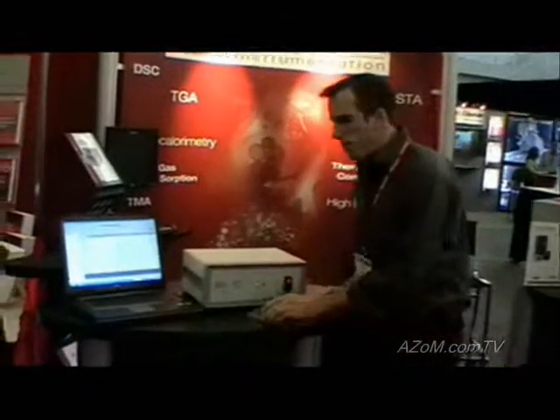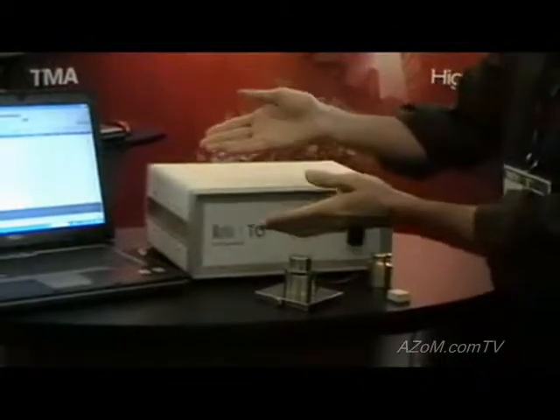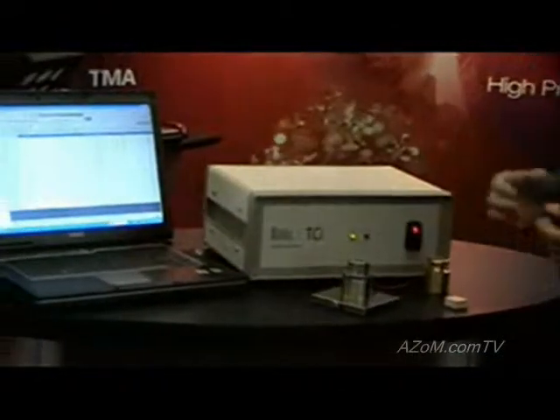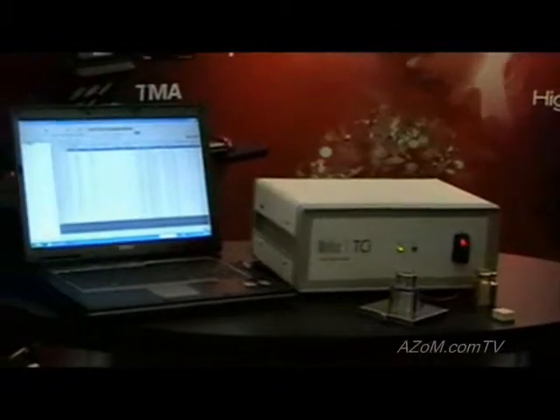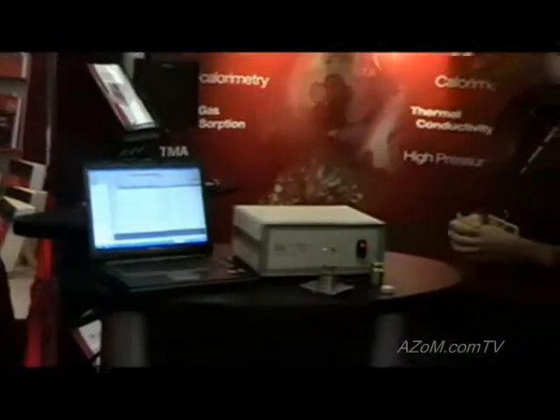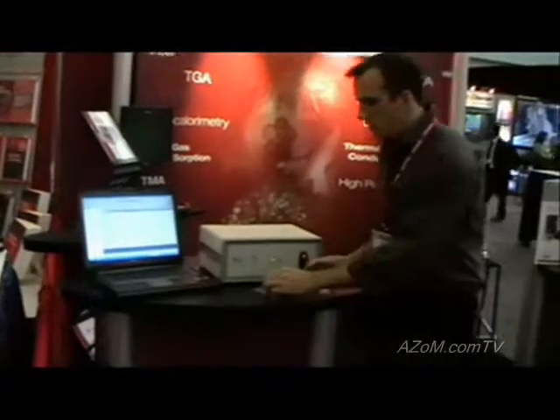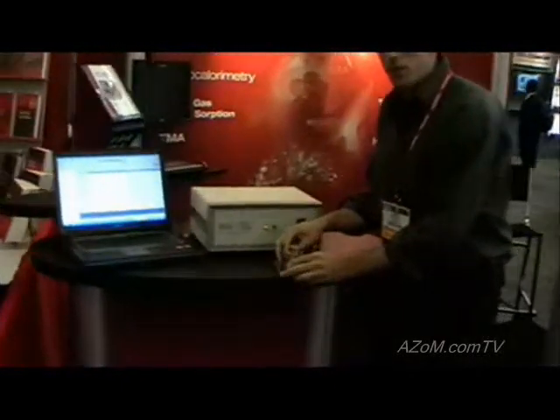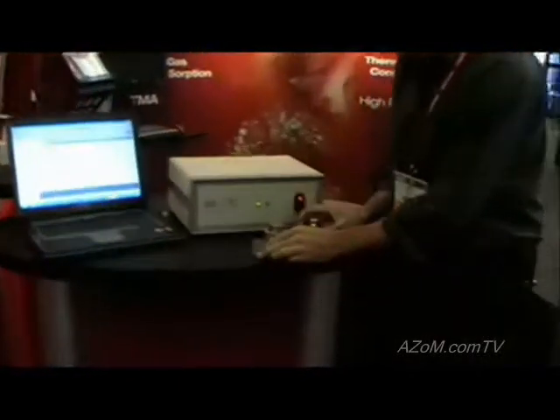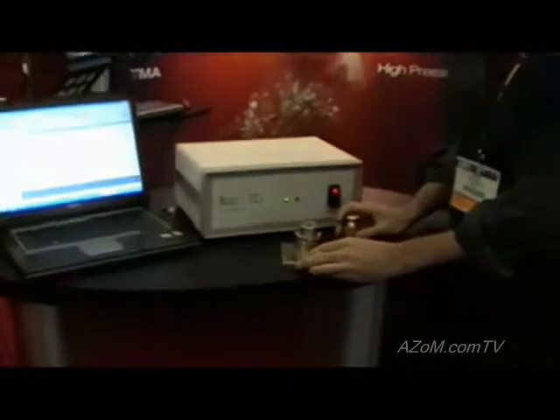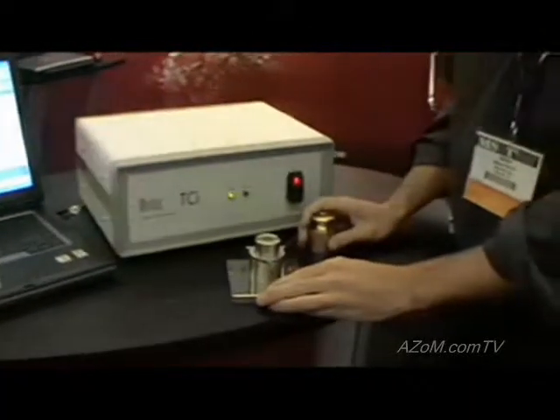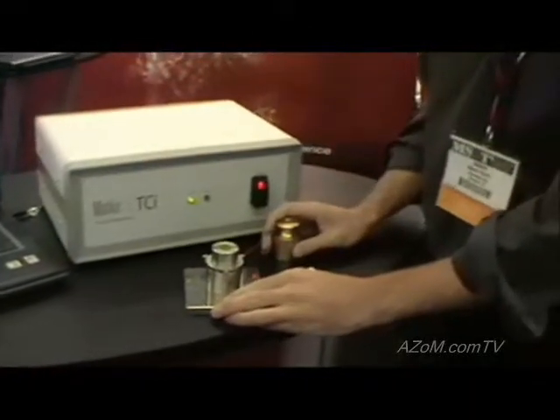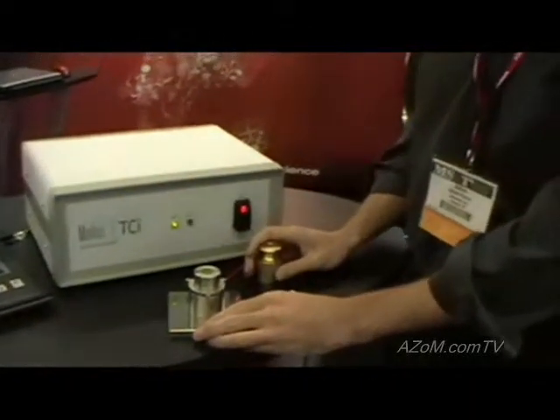The device itself comprises a sensor, controller, and laptop pre-installed with the C-Therm TCI software. The sensor itself provides the ease of use in rapidly testing a variety of materials at a thermal conductivity range of 0 to 100 watts per meter Kelvin.